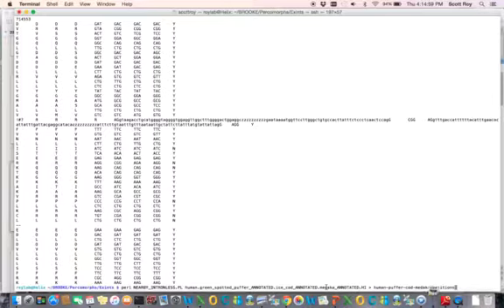All right, so now we want to study this local region and figure out more about what's going on. So we have this position in this kind of abstracted context. We have a little bit of local alignment, but we don't have the whole thing. So the first thing we need to do is work from this intron position to get the overall sequence.